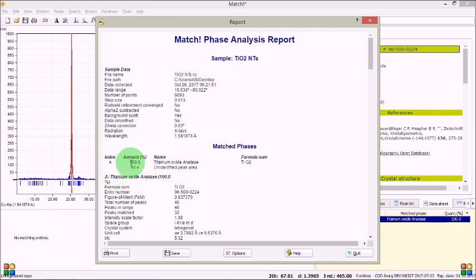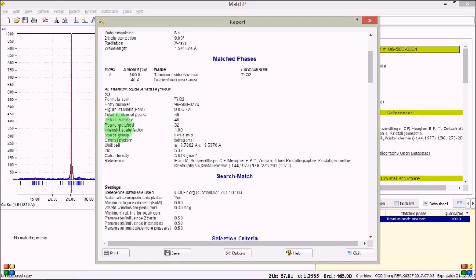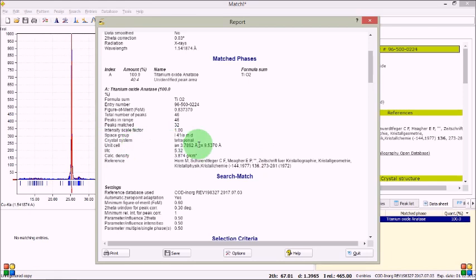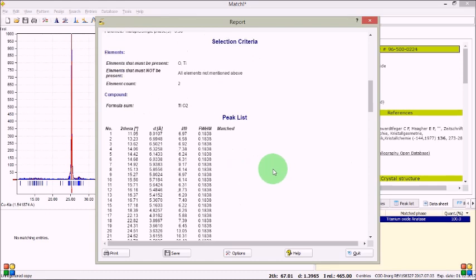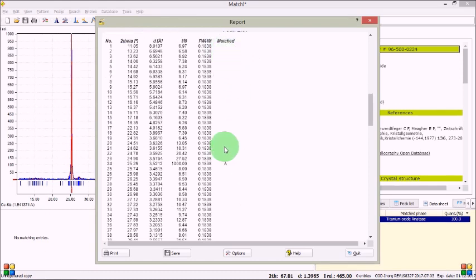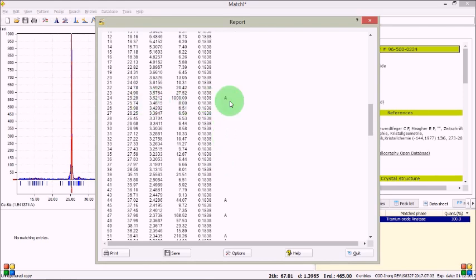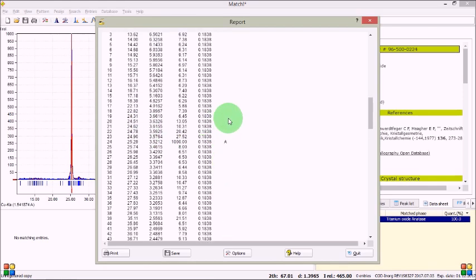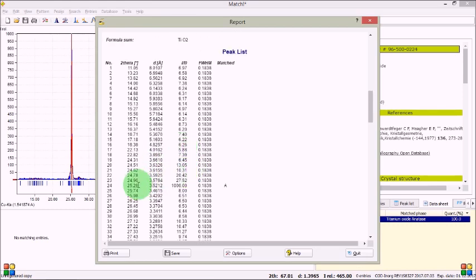ARA for this time is representing the titanium oxide in anatase phase and it has given space group, peak matched peaks in range everything there, calculated density in the crystal system unit cell parameters everything there and you can see these are the matched values or matched planes. So everyone knows the 101 plane is the most prominent plane in TiO2 and we also have got the maximum intensity here for the anatase 101 plane and other planes are there as well. So you can see it.